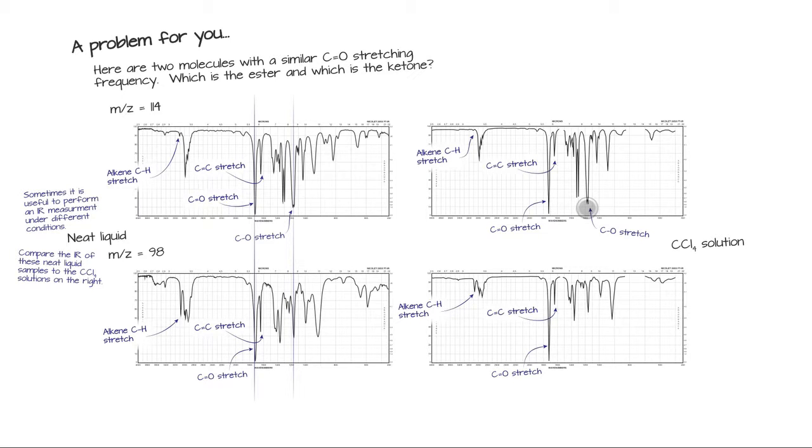You know, the difference between 90, you're already 90% and you're significantly attenuated, you're still pretty strong. So that is definitely a carbon-oxygen stretch. And here we saw it go from 70%, and it dropped quite a bit right down to like 40% or 30% transmittance there. So relative to the carbonyl peak, that's not very strong. Relative to the carbonyl peak, that is still strong. So I know that's a strong peak, and that CO needs to be strong. So that is a CO peak. So I've got a carbon-oxygen peak here. I've got the carbonyl stretch. It's a little lower than I expect.